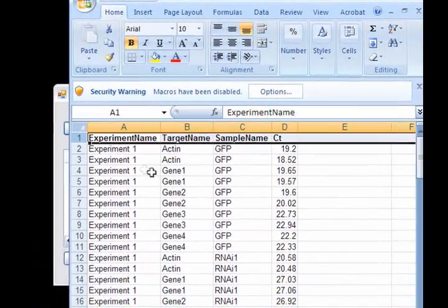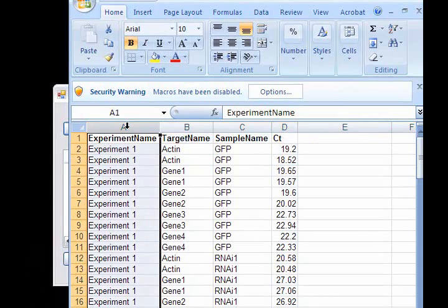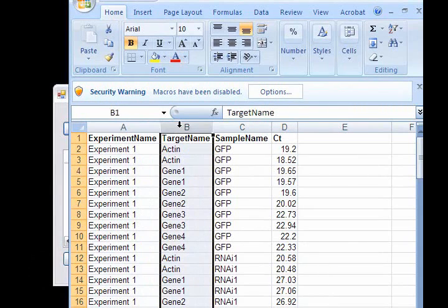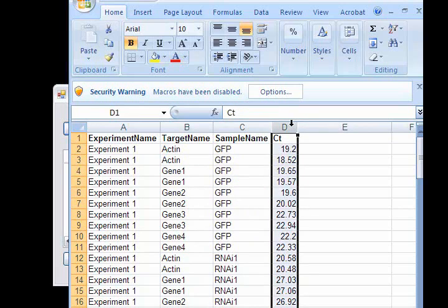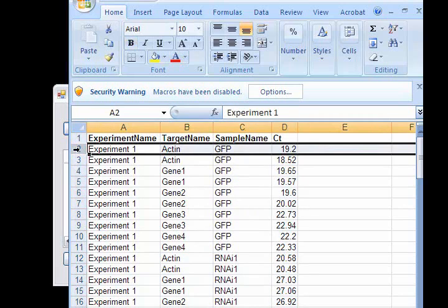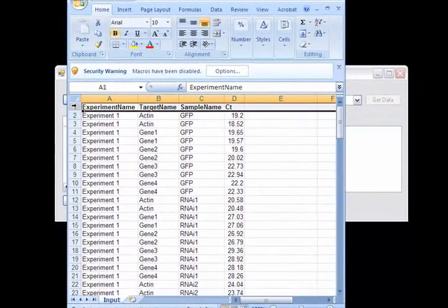Your file must be formatted following specific rules. Experiment name must be in column A, target name must be in column B, sample name must be in column C, and CT values must be in column D. All data should start in row 2. Row 1 should contain header names.